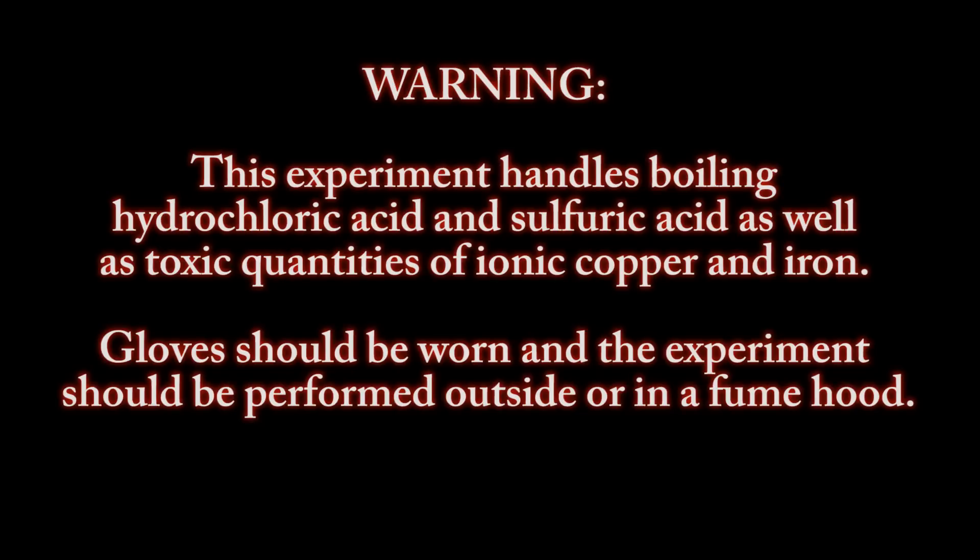Warning, this experiment handles boiling hydrochloric acid and sulfuric acid as well as toxic quantities of ionic copper and iron. Gloves should be worn and the experiment should be performed outside or in a fume hood.